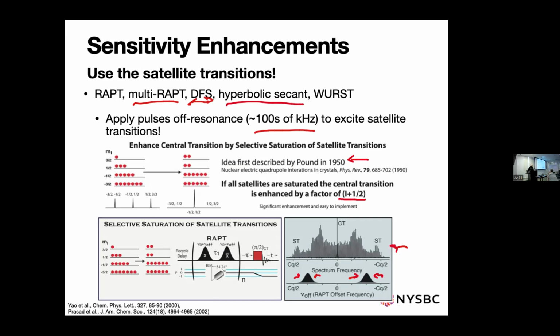And what about their T1? Don't they just come right back, or what do they do? Yeah, so the tau here is pretty short, so you're going to then immediately hit the central transition with the pulse and acquire. But yeah, they will come back, obviously, but the idea is that you're doing this right before you're acquiring. It's just a cute idea. Microseconds before. Or you can apply WURST pulses on them as well to try to invert the satellite transition.